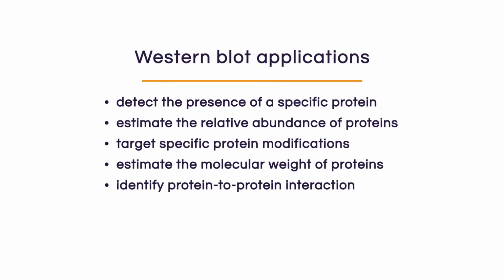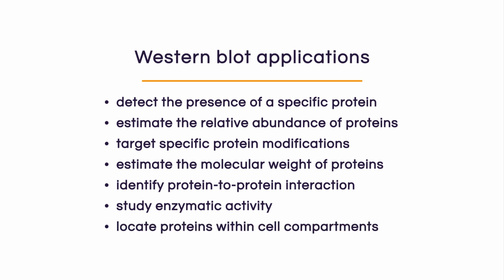Now, there are many other applications for Western blot, most of them somewhat complex, such as identifying protein-to-protein interaction, or perhaps studying enzymatic activity, or even identifying which cell compartment a specific protein is localized. But we're not going to be talking about those in this series of Lambda U courses. We're going to save those for more advanced Lambda U courses.